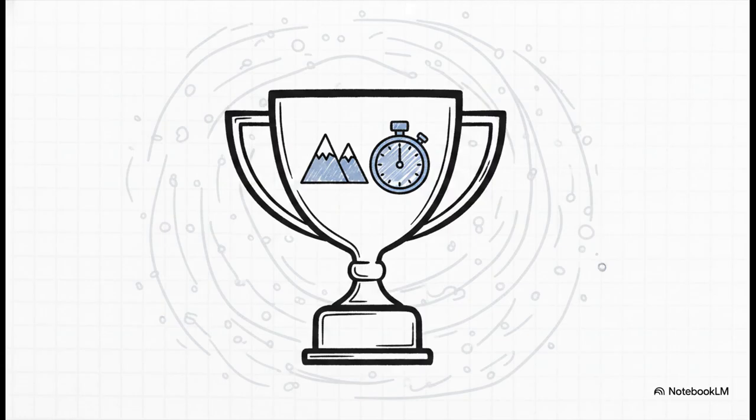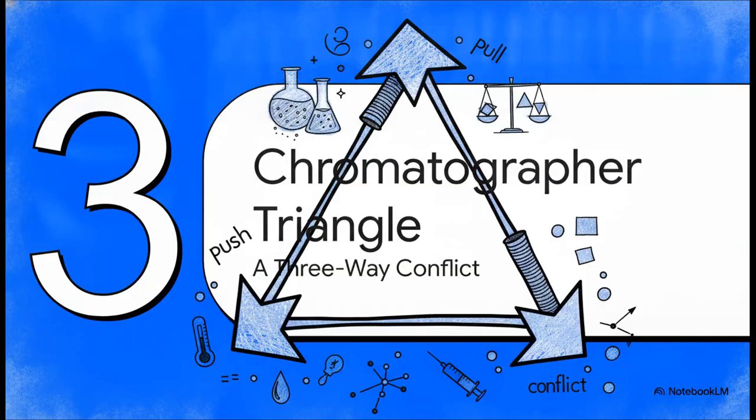So, with all those dizzying variables, we have to keep our eyes on the prize. In the whole optimization process, resolution and elution time are really your two most important dependent variables. The ultimate goal? To separate the components you actually care about in the absolute minimum amount of time. That's what it all boils down to. Which leads us perfectly into Section 3, the chromatographer's triangle.